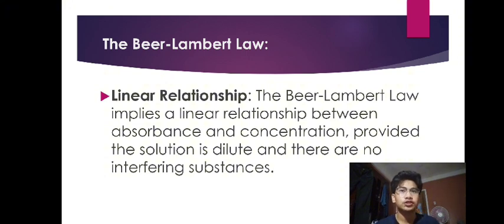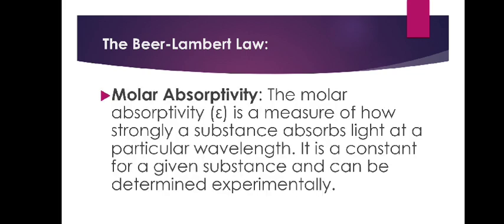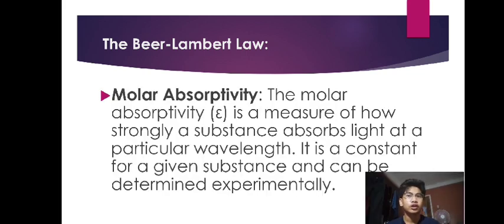A linear relationship between the absorbance and concentration is implied, provided the solution is dilute and there are no interfering substances. The molar absorptivity is a measure of how strongly a substance absorbs light at a particular wavelength. It is a constant for a given substance and can be determined experimentally.